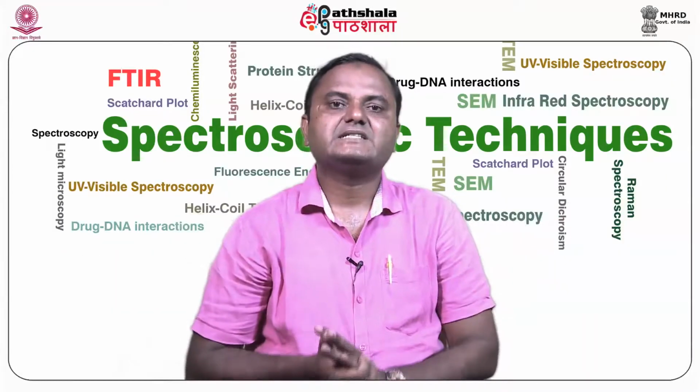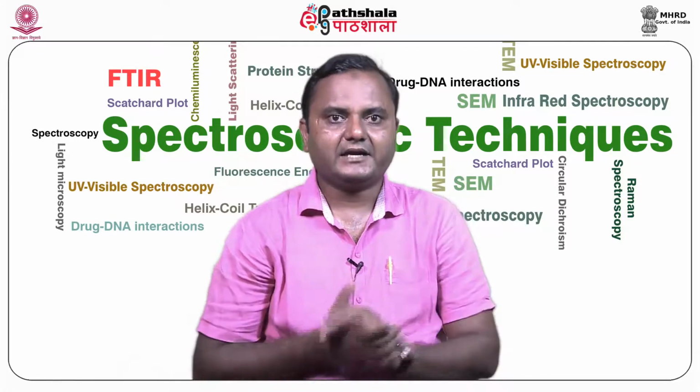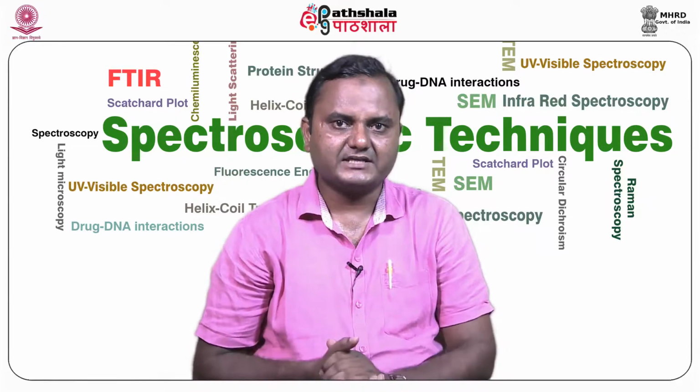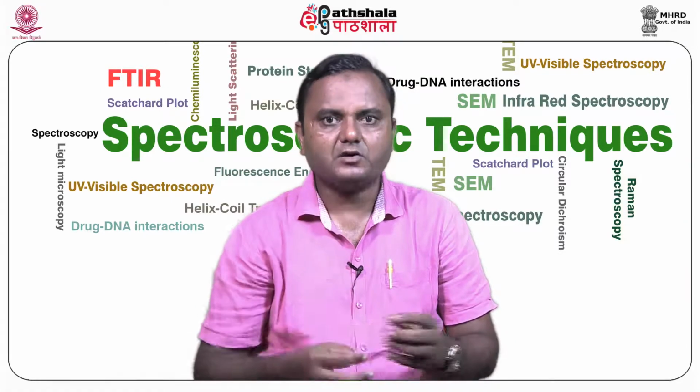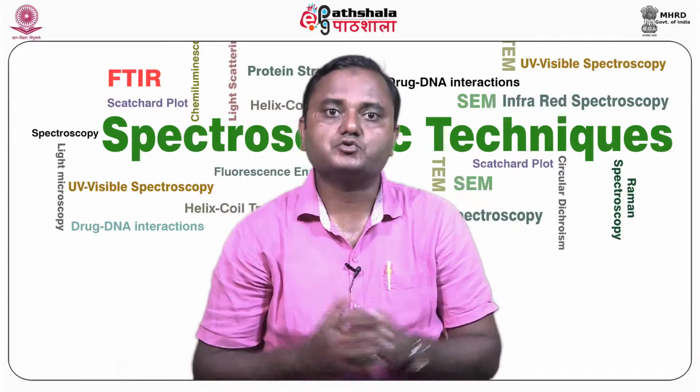Now we discuss static light scattering. Static light scattering is an optical technique that measures the intensity of scattered light in dependence of the scattering angle to obtain information about the scattering source.